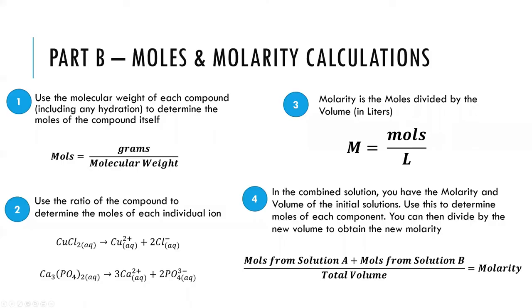So with the solutions prepared, you're going to be determining what are the molarities of these solutions, and the molarities, not only in terms of the molecule itself, but also of each of the individual components, all of the different ions. So first you need to determine how many moles are present in each one of your two prepared solutions, the solutions you're preparing using the weighed out solid material.